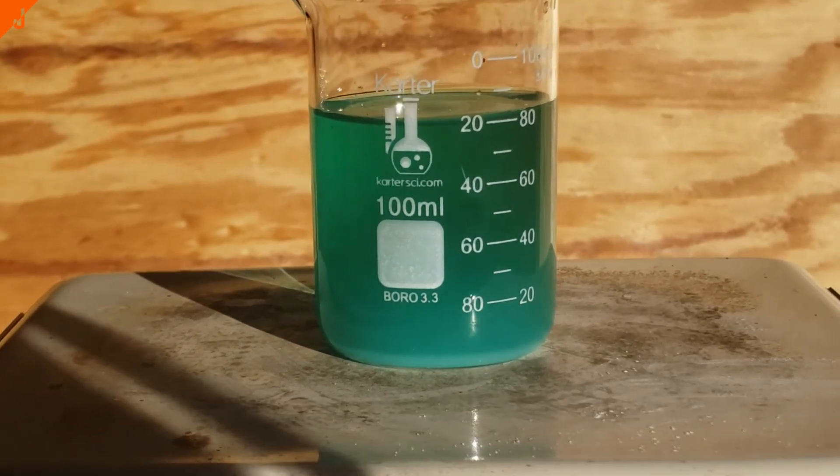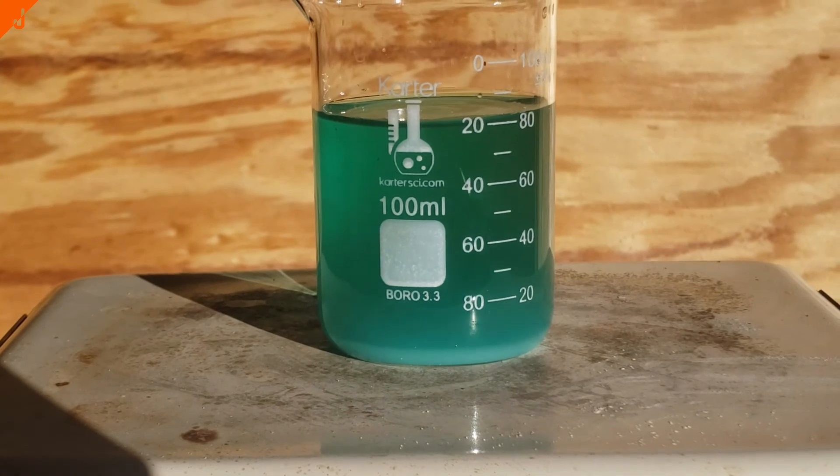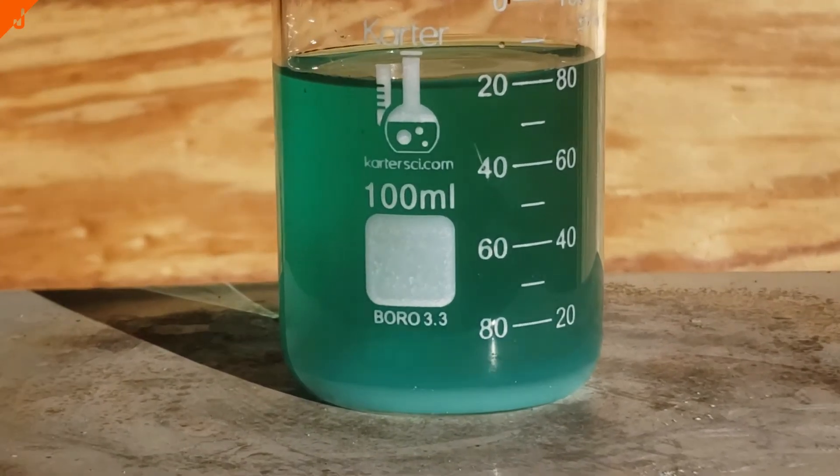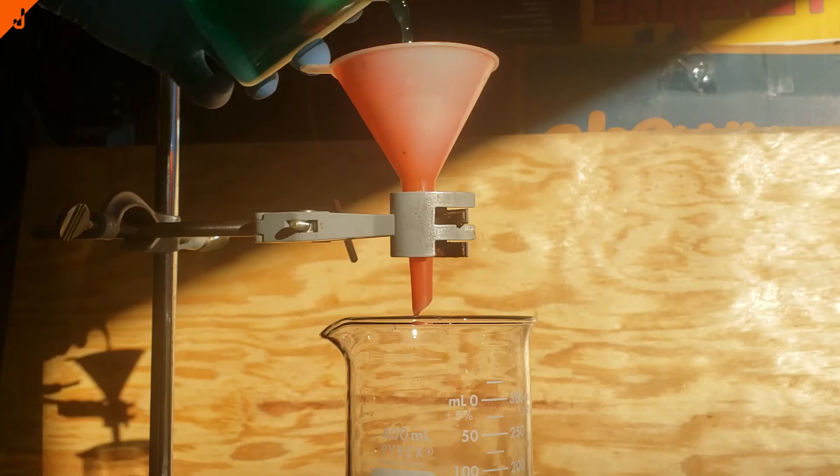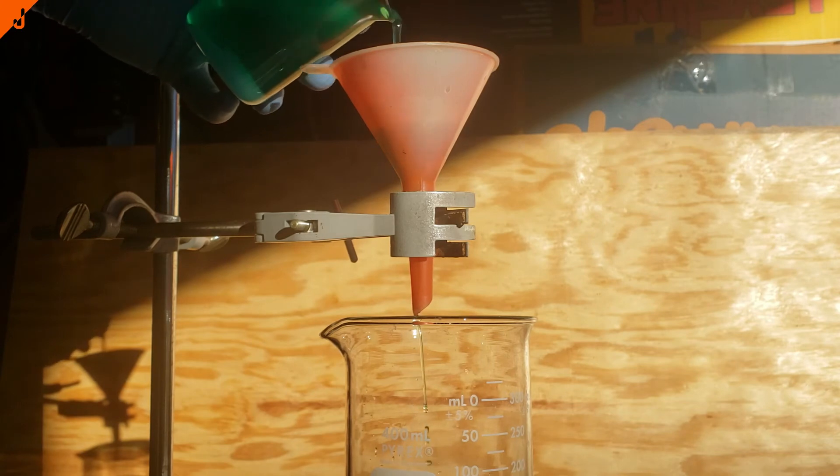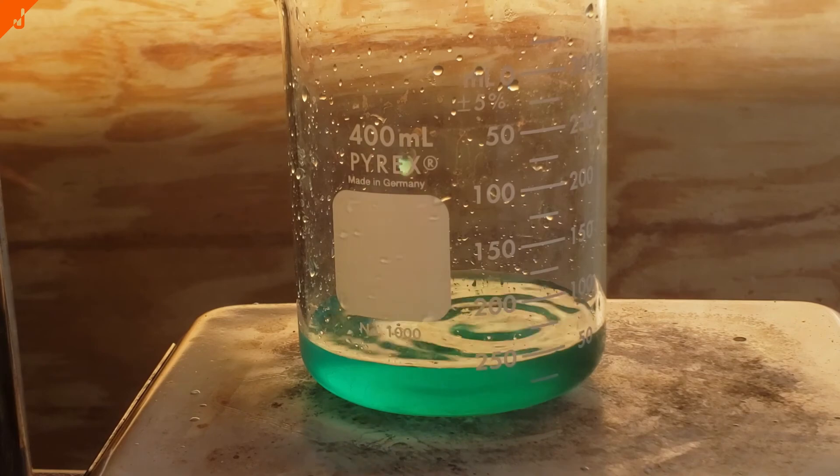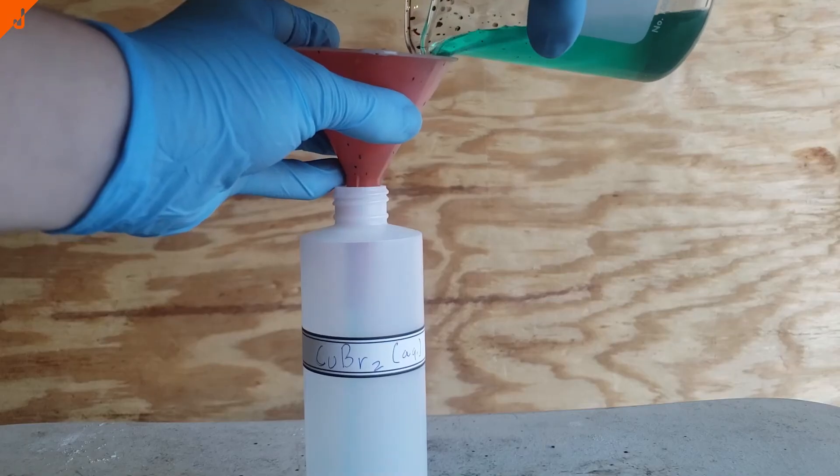Anyway, I let this stir for a bit longer, and then I set up for gravity filtration. As I filtered, the dark purple to orange spots all over my table and glassware really started to become evident.